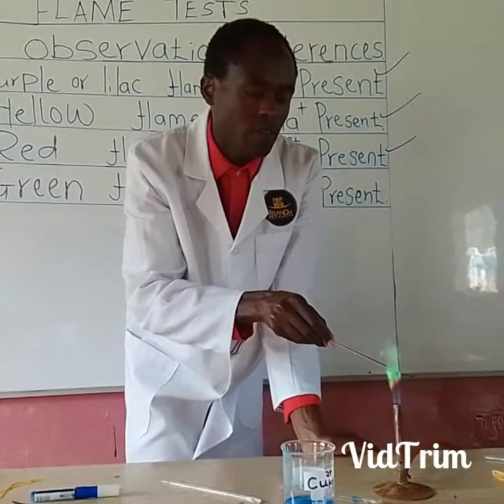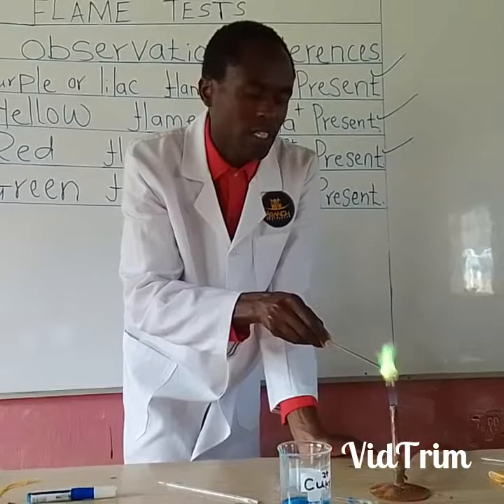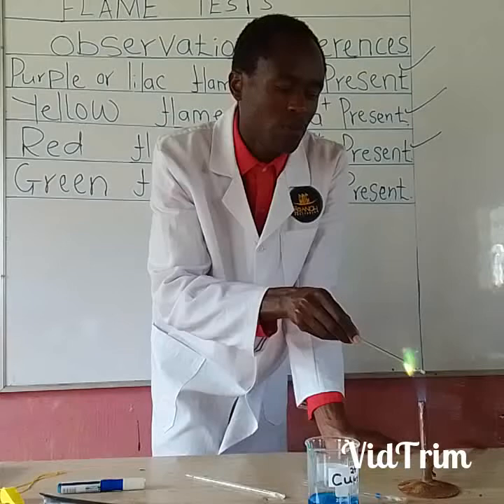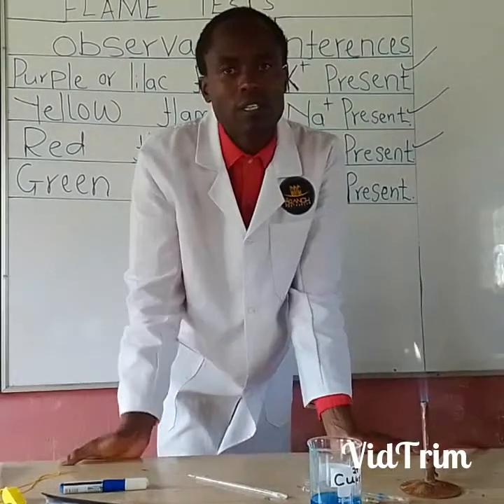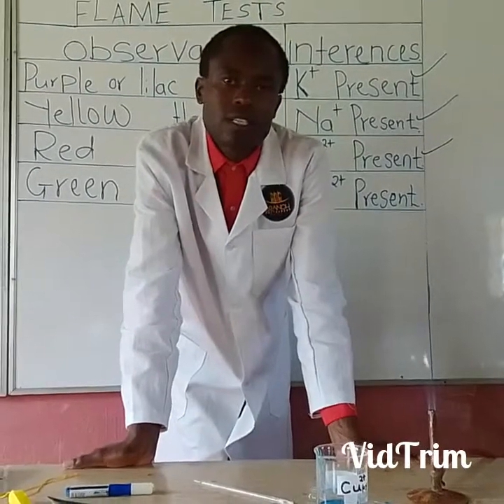A green flame, copper 2 ions present. So that's all about the 4 cations.